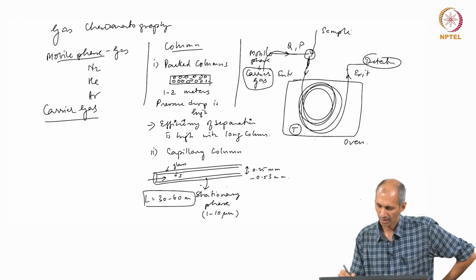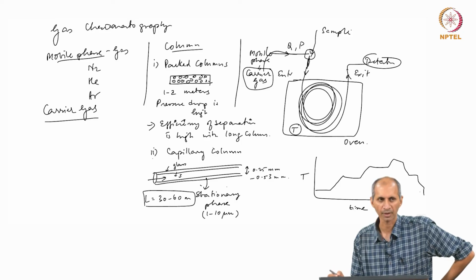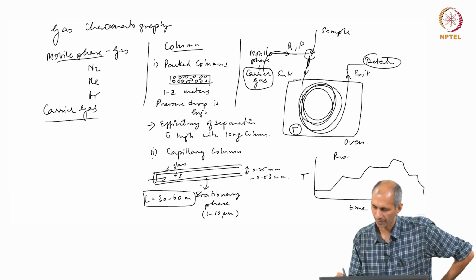So, you can run the entire analysis as temperature profiles. You can start at one temperature, go up, and you can keep doing whatever you want. You can keep going up and down. You can program the temperature in a particular analysis.